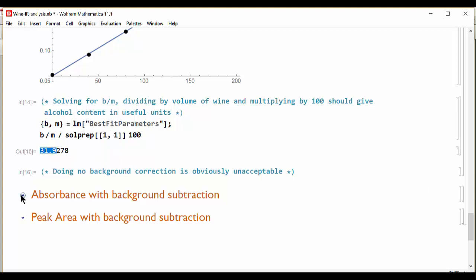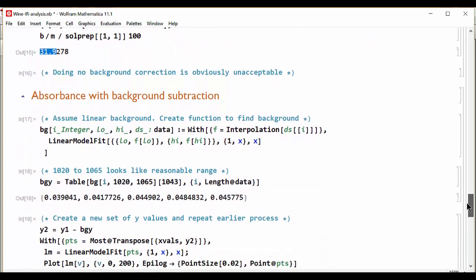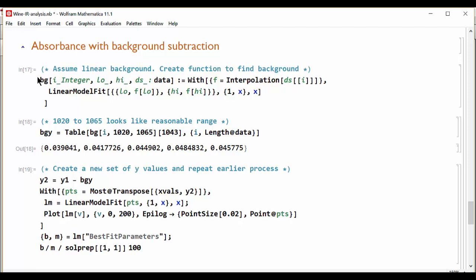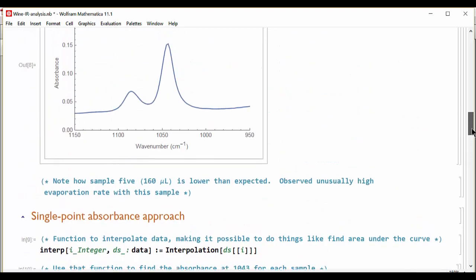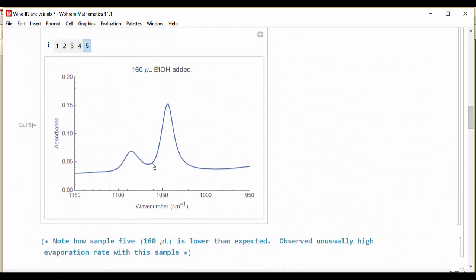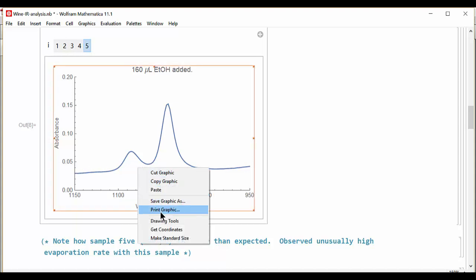The reason for that is because we are not doing any background subtraction, so let's look at how we would go about doing this. Starting off with our absorbance, we need to calculate the amount of background. If we take another look at the plots up here, what we are actually trying to do is noticing that this point is not at 0 and this point is not at 0—it is around 0.04. So there is a fair amount of space down here, background that needs to be subtracted out of our measurement.